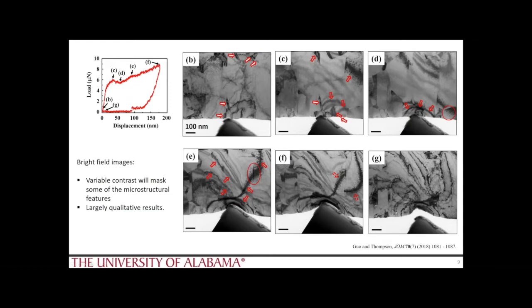And so now we're really stuck with trying to decipher what has transpired microstructurally in each of these sequences, particularly in the post-mortem construction. And clearly, there's a lot of plastic deformation that seems to be masking the features and the grain structures that are actually in the sample.